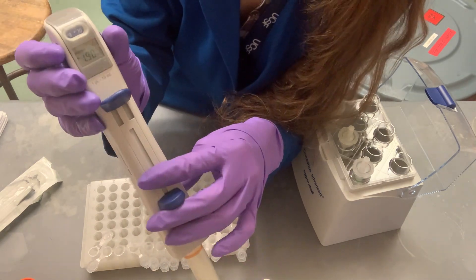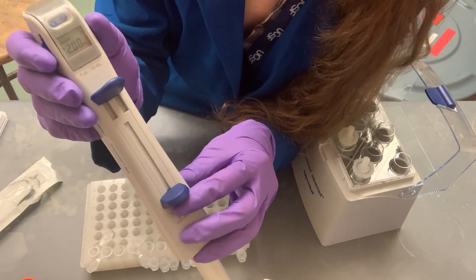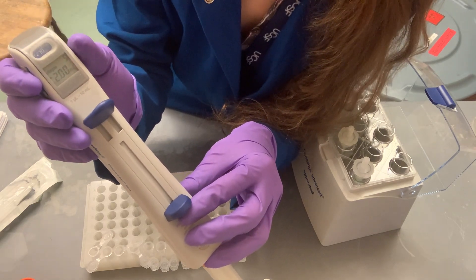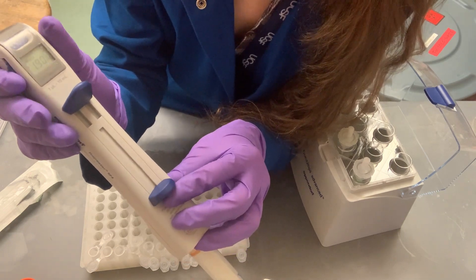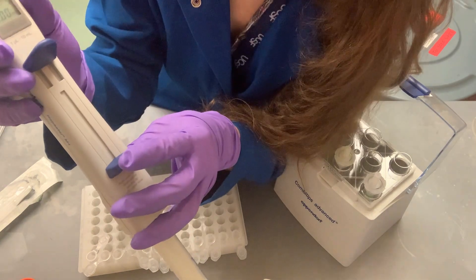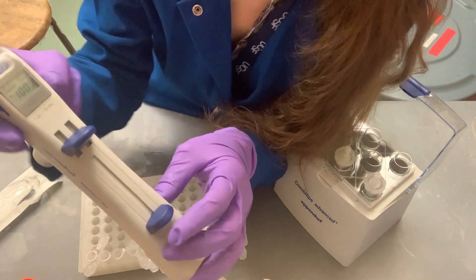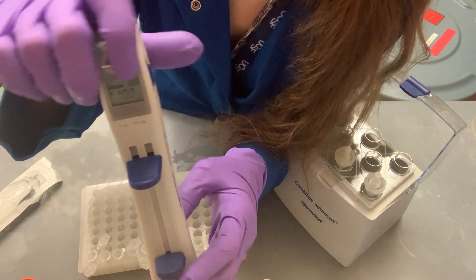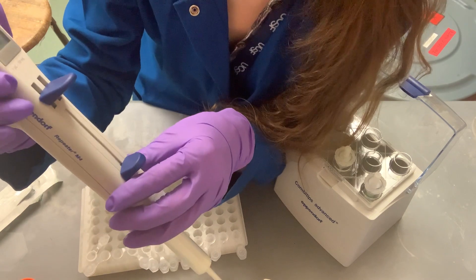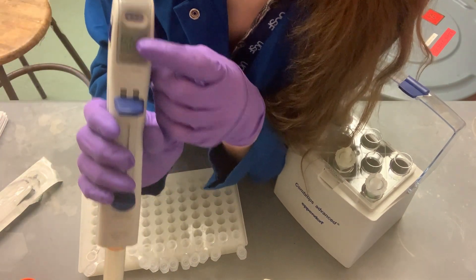Now you need to set your step size — how much you're going to pipette each time. With the 10 mL tip, you can go by multiples of 0.1 mL (100 µL). You can go up to 2 mL per step — giving 5 steps total — or down to 100 µL per step, allowing 100 dispensings. I'll set it to 500 µL (half a mL), which gives 20 aliquots.